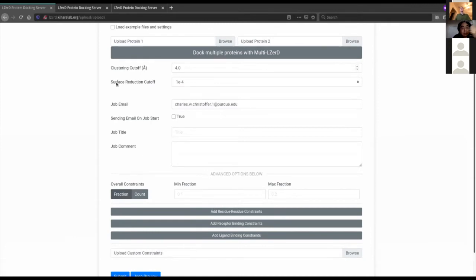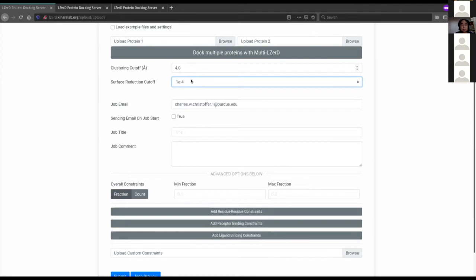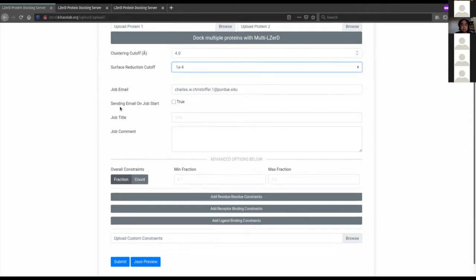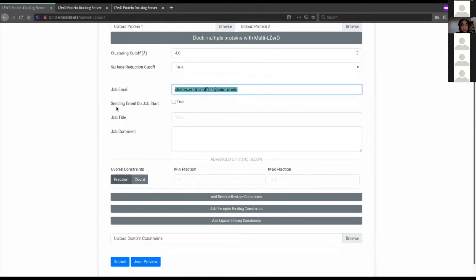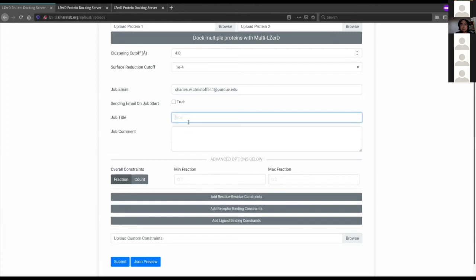We see the job email, automatically filled in from when you created your account. If you don't create an account, you can specify an email manually. There's a checkbox for whether you want to receive an email when your job starts, plus job title and job comment fields to annotate your job. The job title will show up in the table of submitted jobs.